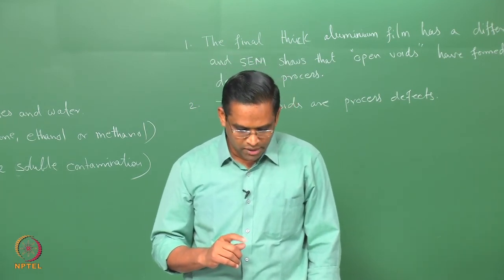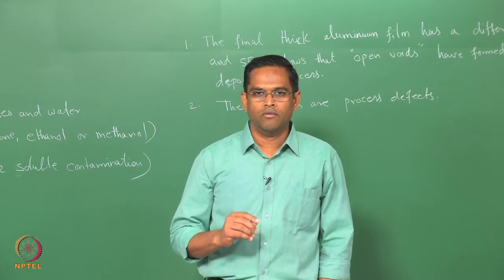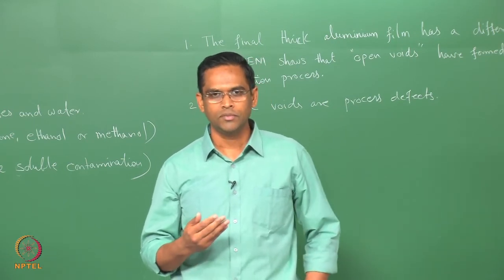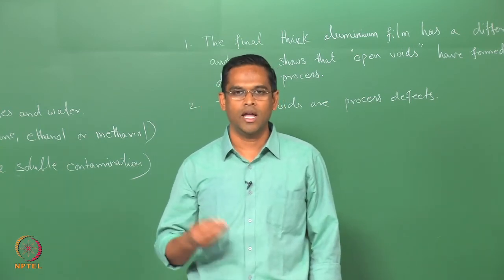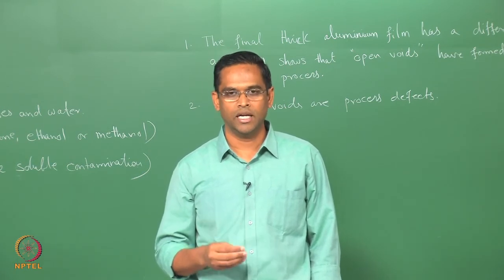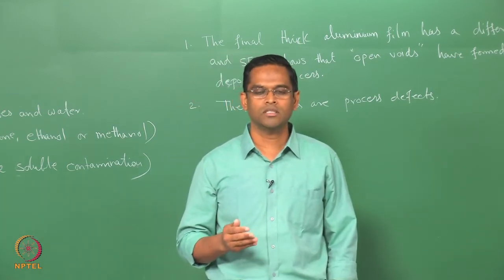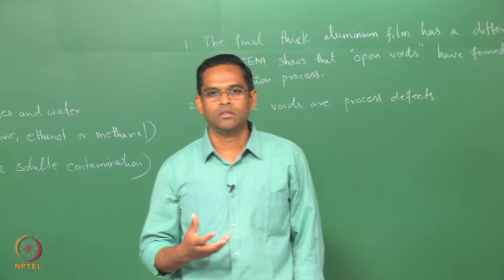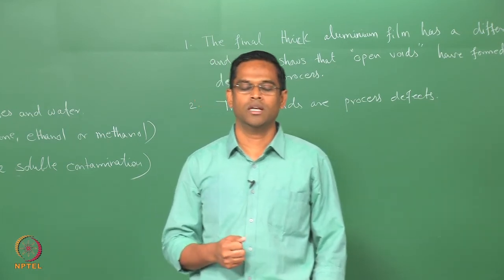So, what I want to conclude from this session of the tutorial is, first of all you have to choose what kind of microanalysis you want to do, whether you want to find out the light elements or higher atomic number elements. Please understand, light elements will not be detected by this technique, and this technique can be used for higher atomic number elements. The concentration of each element to be analyzed should also be present in the system in sufficient quantity, otherwise this technique will not capture those elements.